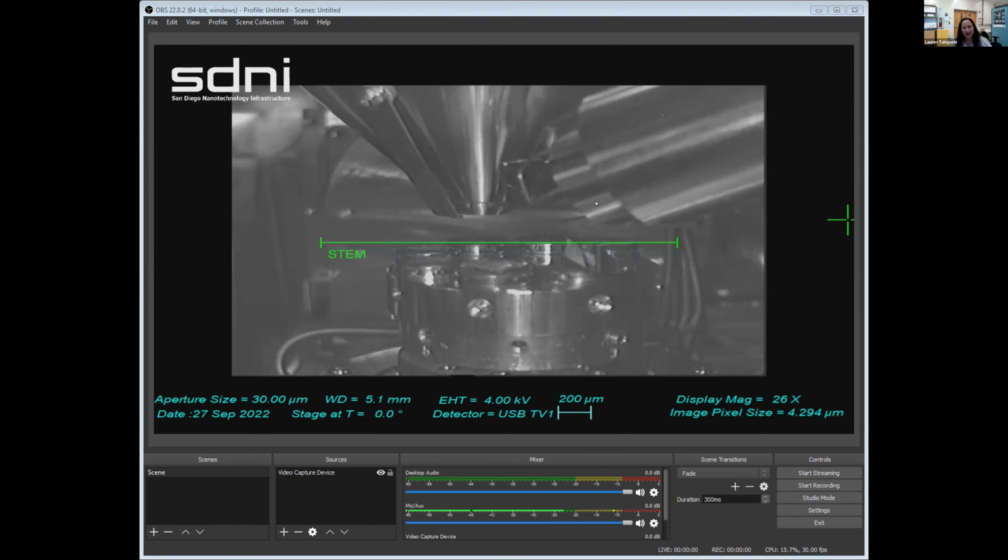And then you might have seen some pictures of the SEM and we're kind of wondering, why is it grayscale? Like, I want to see some color. But unfortunately, SEM creates an image by counting the number of electrons that are seen in one place versus another place. And because of that, we do not have a detector that translates those counts directly to color. A camera sensor, on the other hand, can sense different colors of light by the energy received. But for SEM, we are spitting electrons at the same energy and then simply counting the electrons that the detectors detect. Therefore, the images can only be black and white. White means more electrons and dark means less.